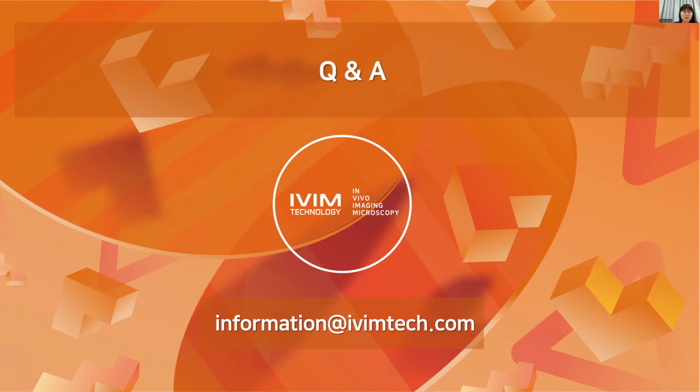Thank you. And the next question is, do you have an in-house software to analyze T and B cell entry in the lymph node, or did you use software from other vendors? Okay, for analyzing the T and B cell entry in the lymph node, we use third-party software like Imaris or something else. But we are trying to optimize to calculate the velocity for basic analysis like the trafficking or measuring the velocity or the cell numbers.